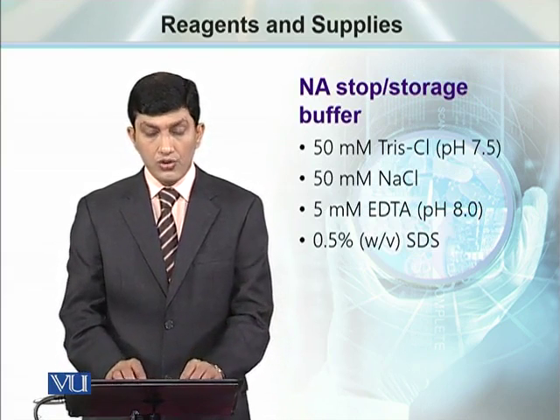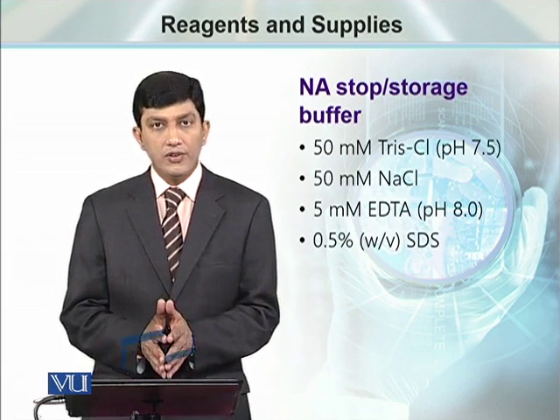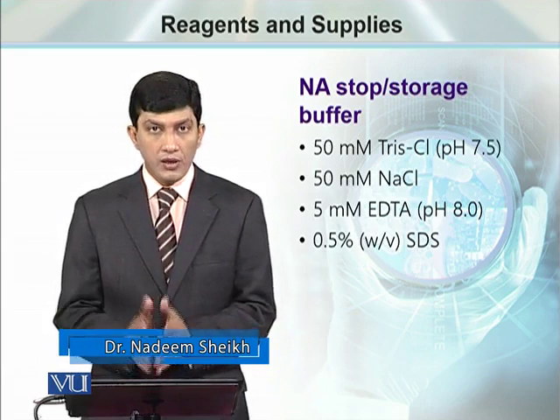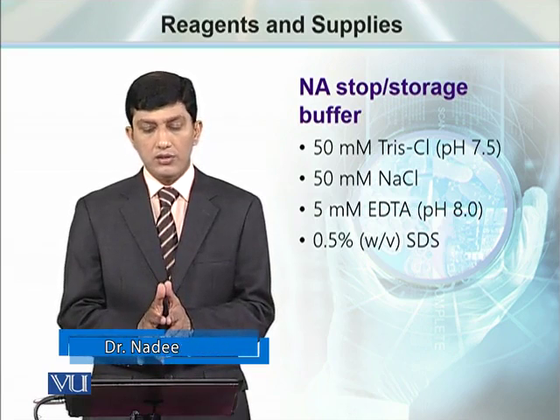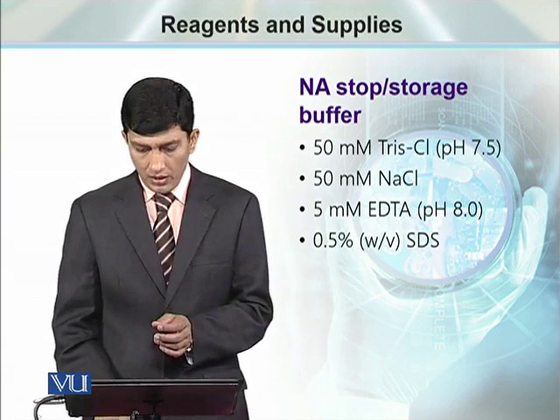Then we need the stop or storage buffer that has a composition of Tris-HCl, sodium chloride, EDTA and SDS. This slide shows you the composition, that what should be the molarity or the concentration or the percentage of different components as well as their pH.